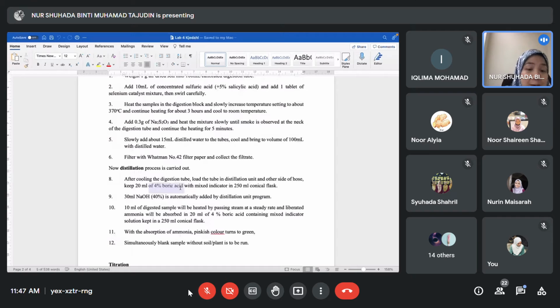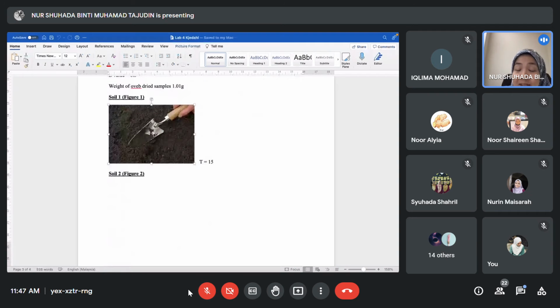Okay, so this is the formula. Okay, so this is the result. Okay, saya gunakan dua jenis sampel. As you know, satu sampel yang berwarna coklat. Okay, so this is the color of the brown soil, which indicates that there is a content of organic matter, and also orange soils tak ada, you nampak tanah dia berbeza. Okay, so this is the value of the T, which you have to calculate according to the formula, and from the results you can calculate. This is the distribution of the marks.